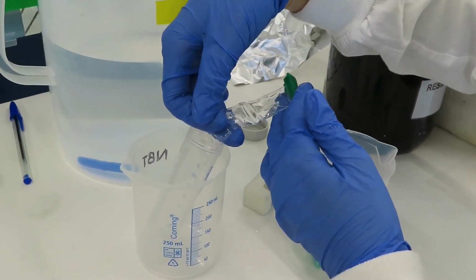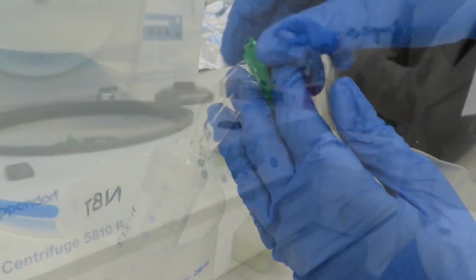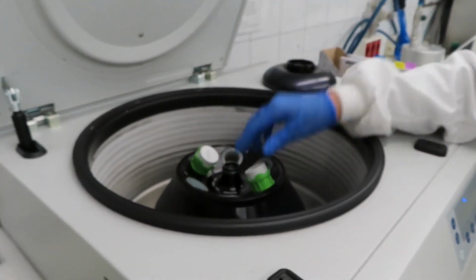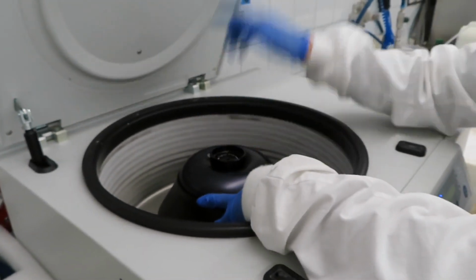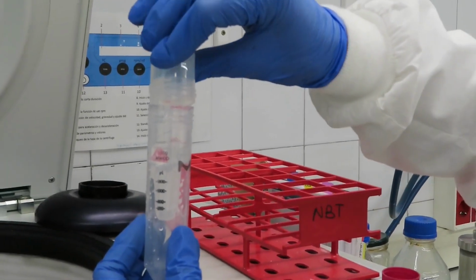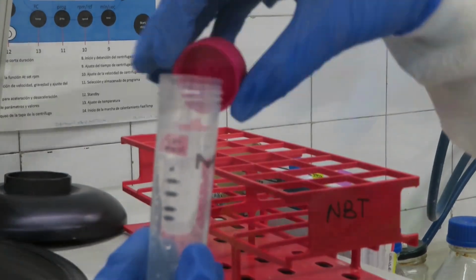The sample, which is now in the buffer requested by the customer, is taken out of the dialysis bag. Just in case, the sample is centrifuged for several minutes to pellet all the aggregates that may have formed during the dialysis. The protein concentration is determined again to know the protein lost during the dialysis. At this moment, the sample can be delivered to the customer or continue with the next purification step.